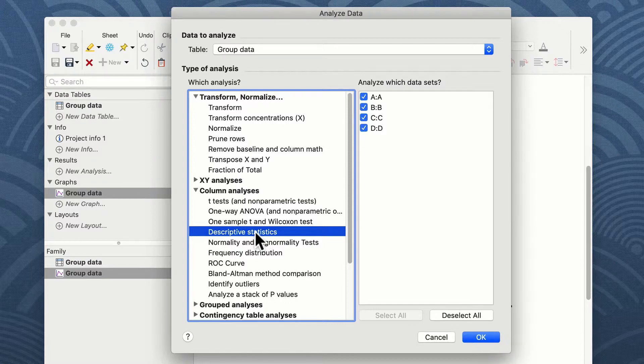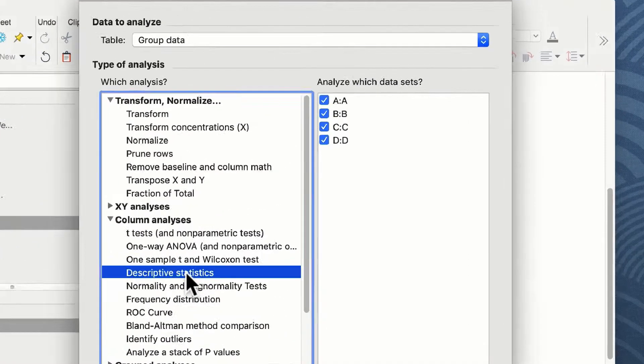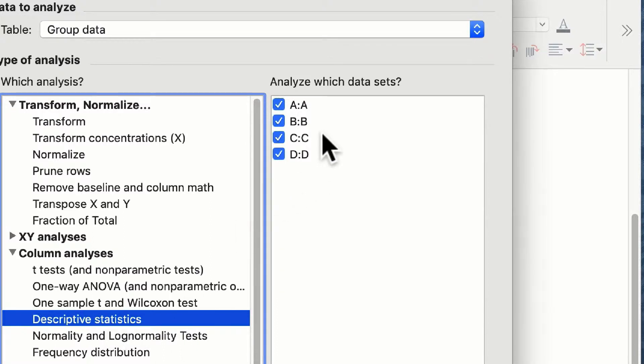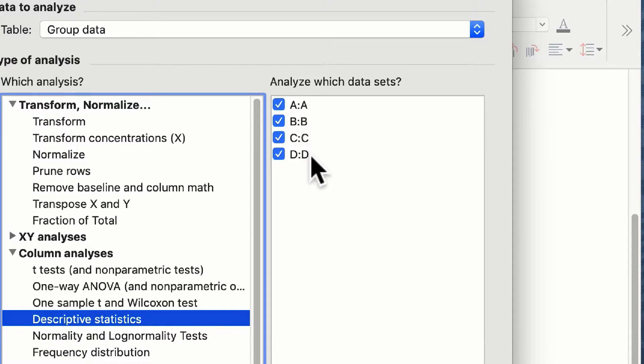I don't have to analyze or show the descriptive statistics from all of my data sets, but in this example I'm going to, so I make sure that in the analyze which data sets option box I've selected A, B, C, and D.